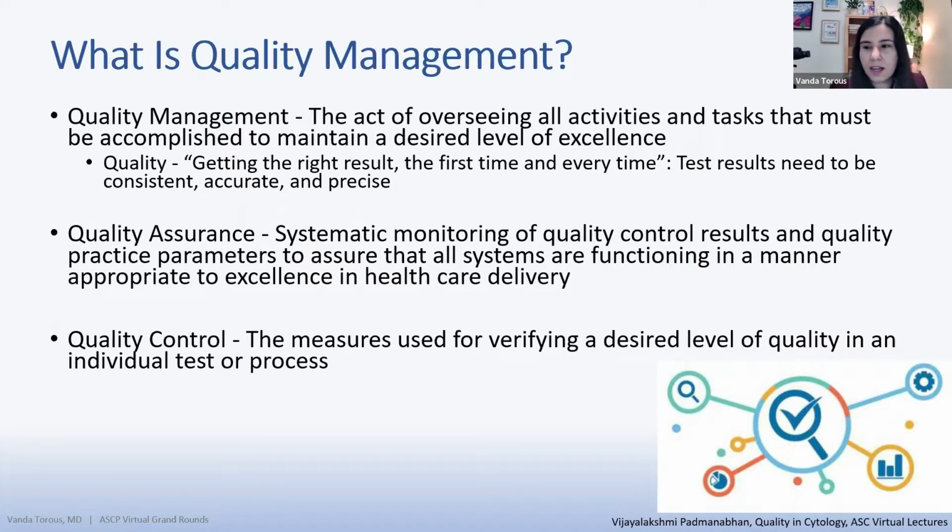So this really includes an ongoing comprehensive program that analyzes every aspect of our operations. Quality control measures are those that are used for verifying a desired level of quality in individual tests or processes. So it's sort of a function of quality assurance in a way.